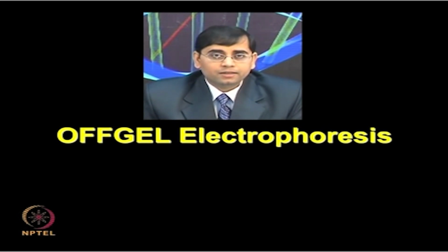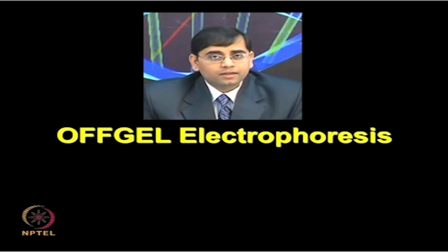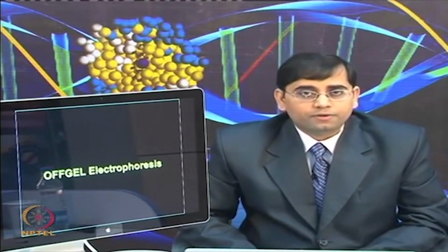This method is mostly used for liquid chromatography based mass spectrometry applications, where people want to separate the proteins to reduce their complexity based on the isoelectric point, but do not want to separate them based on the gel, due to various artifacts which gel based approaches can offer.